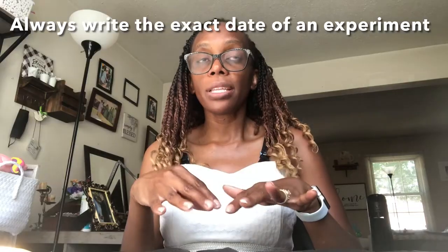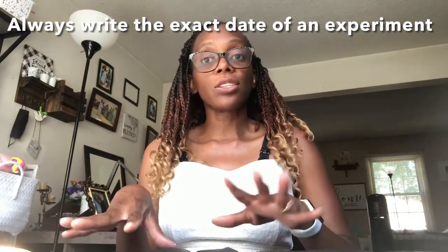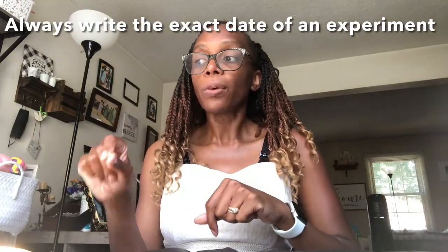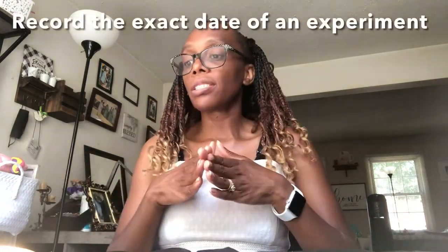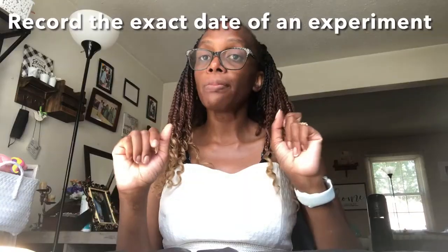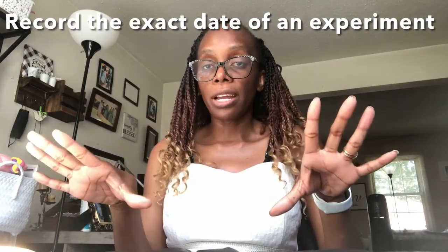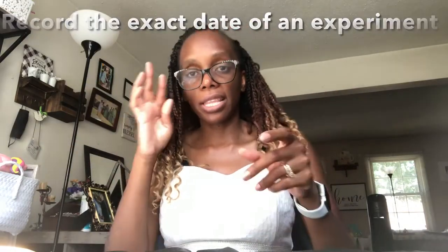Always remember that you might do experiments for each location on different days. That's completely fine, as long as you indicate the date, because that's really important in case your results show some discrepancy between locations. It could be because there's been a gap in when you analyzed. That's why you have your eLab notebook and your photo uploads to record your work. And remember, in science, it's very important for us to record every single thing that happens.